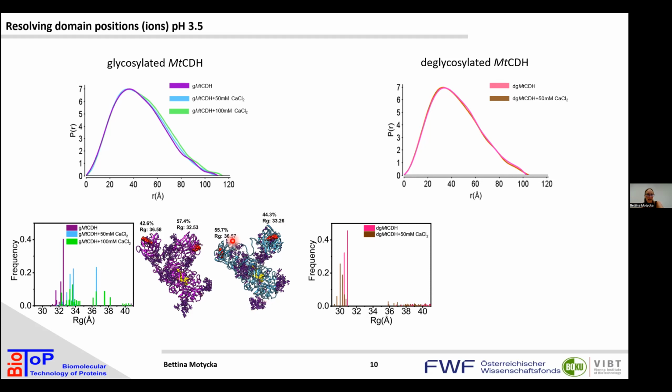And this is the percentage and the Rg from these two models that we take to reconstruct the curve. So what she's got here on top is 2 models per fit, so there are 4 models presented here in total. And the cytochrome domain is visible more than once, while the main domain is superimposed. Yep.